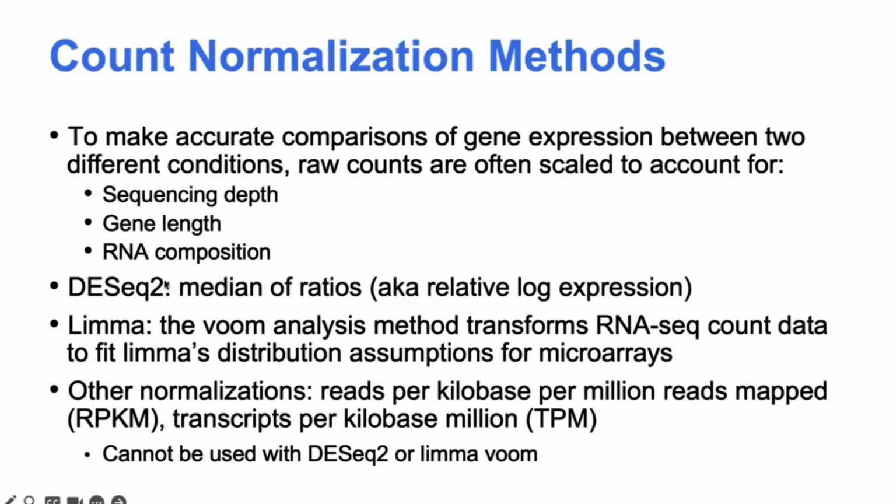But yeah, some other algorithms might use RPKM or TPM, so you might see these out there. But for today, for both DESeq2 and Limma-voom, these two methods have their own library size normalization that's implemented. So the data that we input to these methods should not be in any of these other normalized forms.